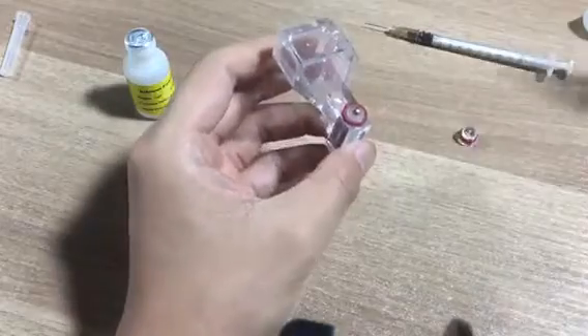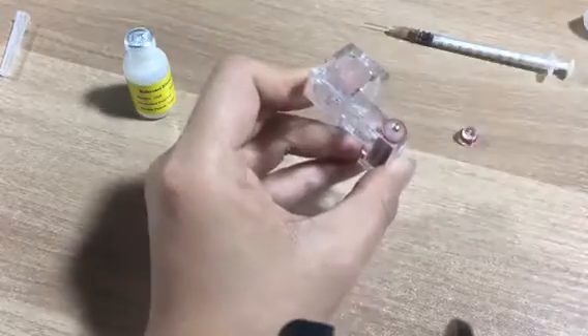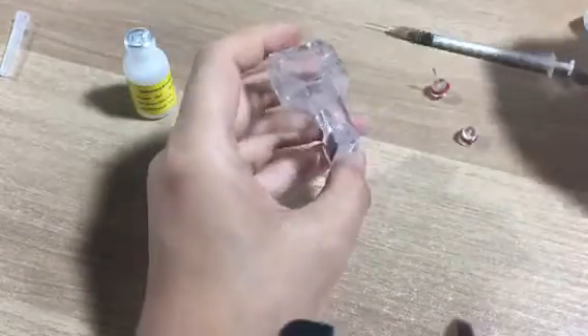Then we use the clipper to take this part. Put it carefully.